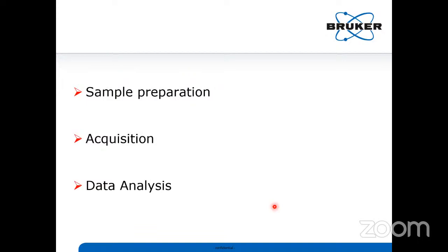Why? Because currently whatever vendors are supplying mass specs, they come with dedicated ready-made methods. So here we don't need to work more on methods. Even for data analysis, we have different ready-made tools. Previously you used to take raw spectra and sit for hours to identify each peak step by step. It used to take more time. Now we have different MS tools where you can directly upload your data. Directly it will give the result as protein identification with the complete spectra, sequence, labeled sequence, everything. Before that, we should be very careful with sample preparation.